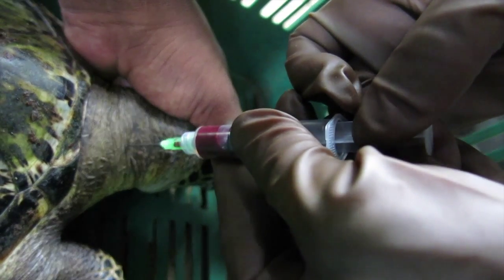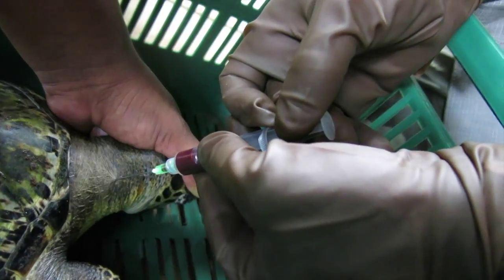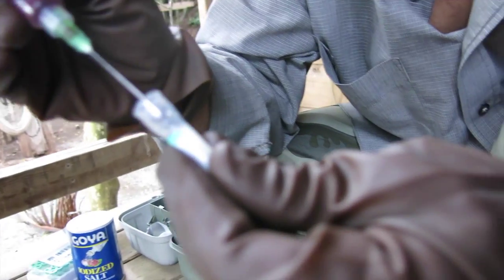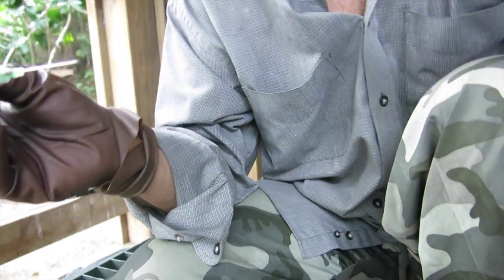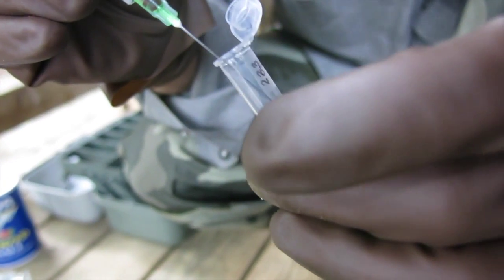I think we've got enough. We put the first sample in a little tube for genetics — just a couple of drops with some cell lysis buffer. Then the others we'll put in a tube and spin down to separate the plasma and the serum out.